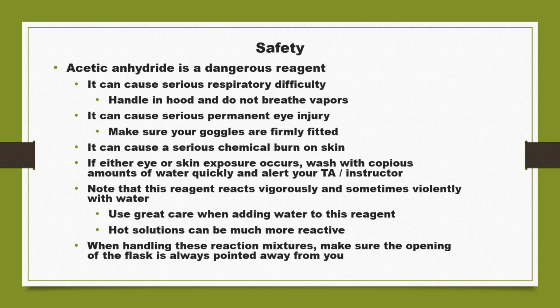And most importantly, safety. This is chemistry. You must always be open-minded and alert in every chemistry experiment, because there is no safe chemical, okay? You have to remember this always. There is no safe chemical in the laboratory. Even water itself, you don't know, it can be contaminated, and you cannot guarantee that you can drink water and claim that it is pure.